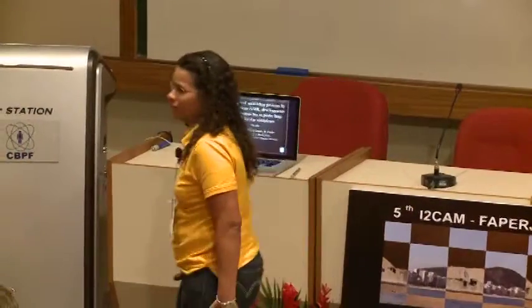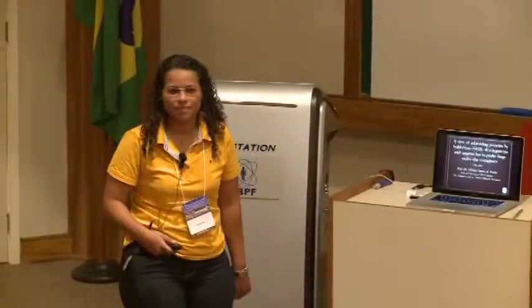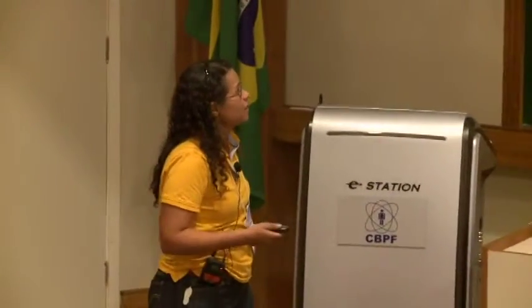I would like to say thanks to the organizers for inviting me to speak in this lecture. I will talk a little bit about solid state NMR, and I will give some examples of how you could use this tool to get information concerning structure.